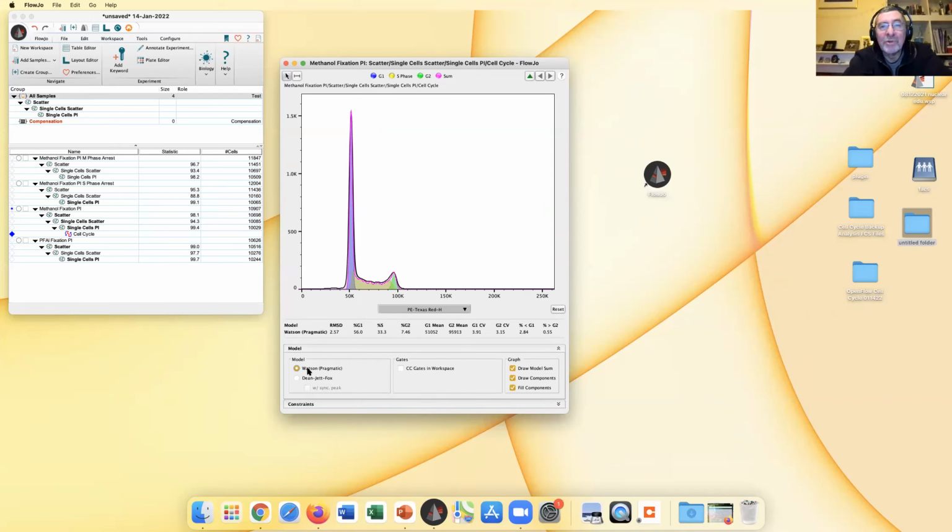Well, there's a couple of questions come through. The first one is about measuring a sub G1 population in FlowJo, and is there any option for that? Sure. So you actually see right here, there's a percentage that's less than G1. Right now that's 2.84%, and you are able to see that. You have to be careful when you're doing your scatter gating and going through all of your gating, because if you're very, very tight with your gating, you might be excluding some of those populations.